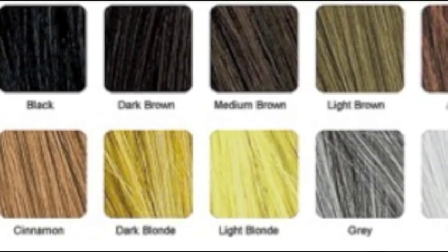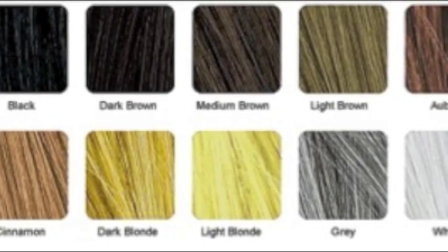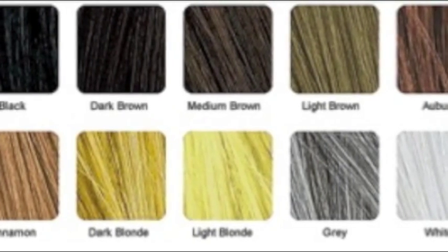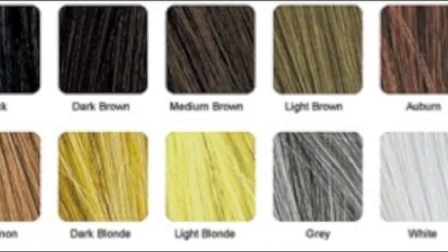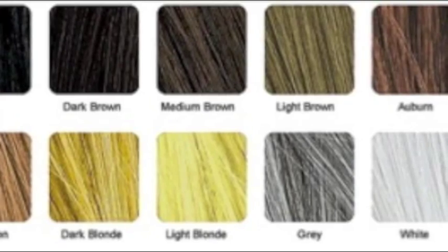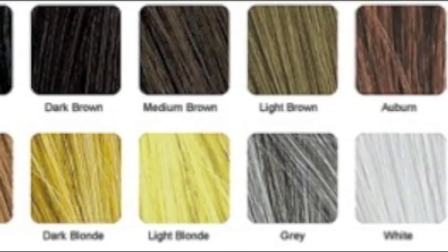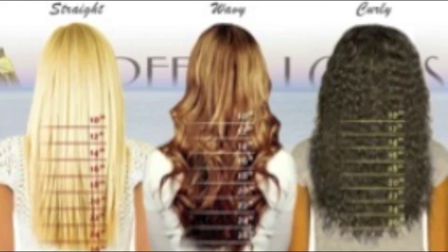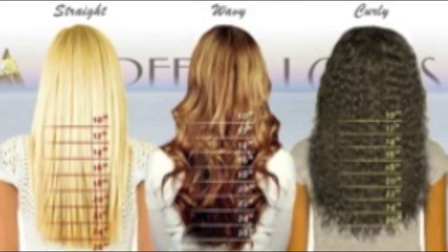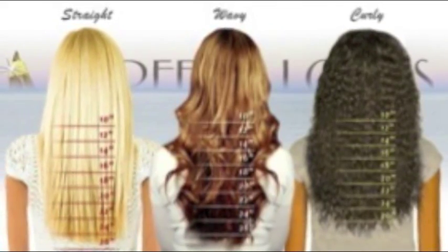There are several macroscopic characteristics that can be observed in hair with the naked eye and with a stereo microscope under relatively low magnification. Color, shade, and intensity can be noted. The shaft form is also important. It can be straight, curled, waved, kinked, or curved, for example. The thickness of the hair strand can be measured or described as fine, medium, coarse, or varied. The length of the shaft is also a significant feature.